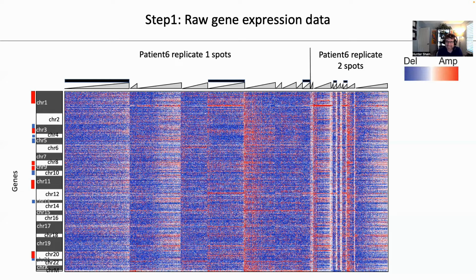Generally speaking, it is not easy when you develop these gene expression matrices if there's too much missing data. So for instance, a spot is mostly missing data, meaning that there are no UMIs corresponding to those genes, to analyze these side by side. And so we recommend, and we've provided in our GitHub repository, scripts that allow you to group spots together. So you can group, for instance, fibroblasts that are from the same gene expression cluster and are contiguous, and analyze a group of 10 fibroblasts side by side with one tumor spot.